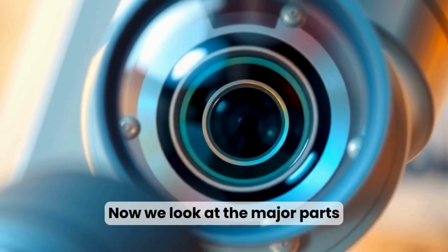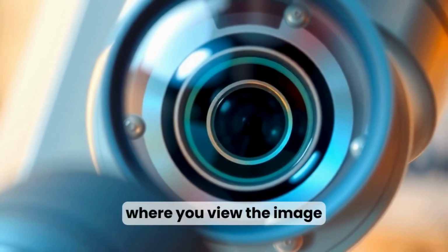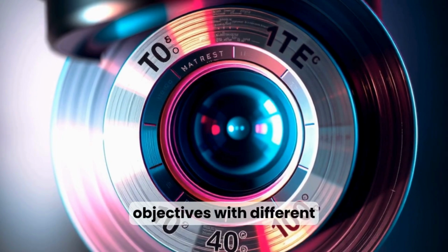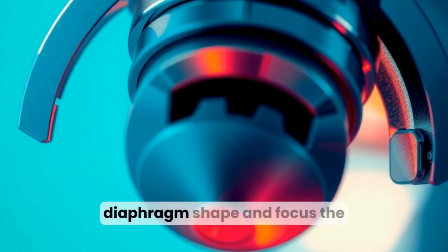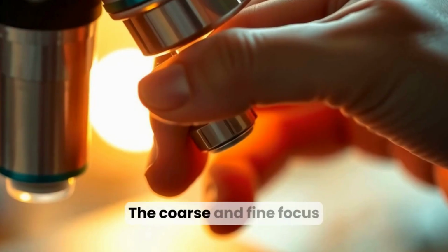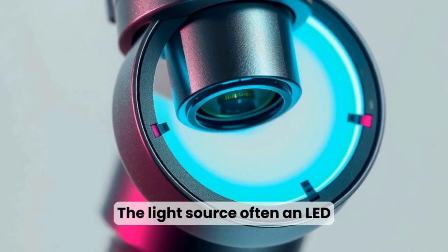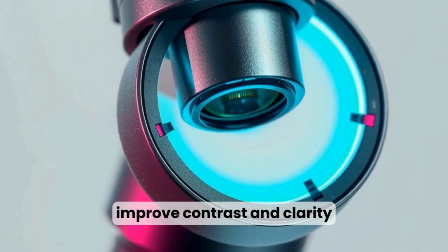Now, we look at the major parts of a compound light microscope, starting with the eyepiece, where you view the image. The objective lenses sit close to the specimen and provide the primary magnification. Microscopes include multiple objectives with different powers. The stage holds the slide, and the condenser and aperture diaphragm shape and focus the light that illuminates the sample. The coarse and fine focus knobs move the stage or objective to bring the specimen into sharp focus. The light source, often an LED, provides stable illumination. Adjusting light intensity can improve contrast and clarity.